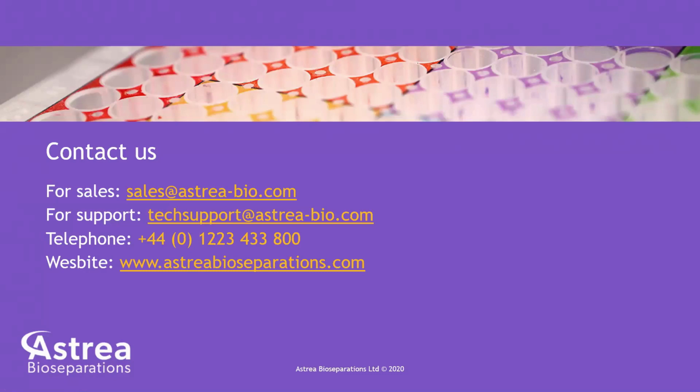I have a few questions for you, Patrick. I think you've maybe answered some of them through the presentation, but just to clarify, if somebody was to obtain a very good hit on the plate, could they obtain bulk adsorbent of that particular ligand? And how long would it take to get around about a liter of adsorbent?